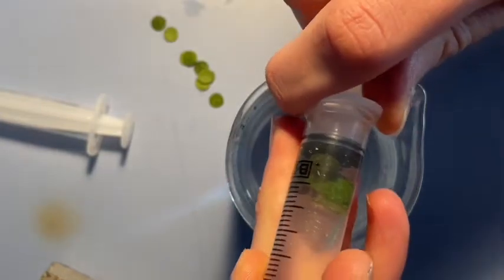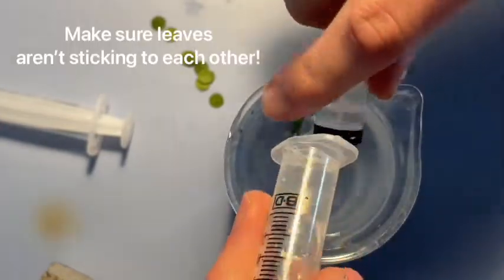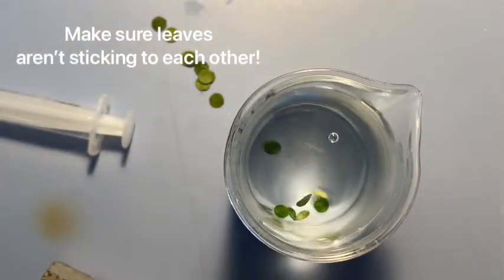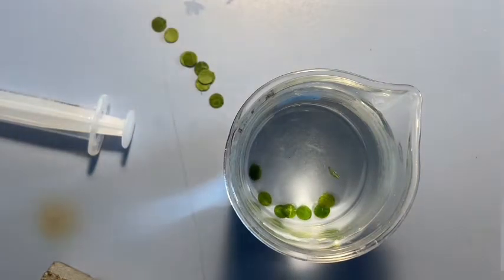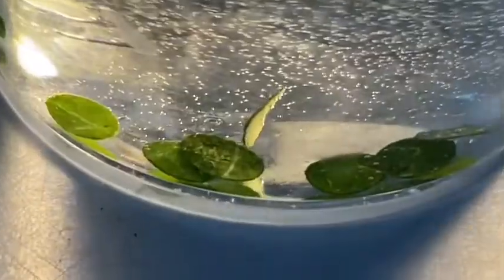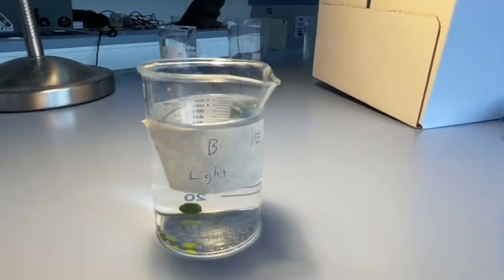Empty those into the beaker once again, and what should happen is the leaves should hopefully sink to the bottom there. So this is my light experiment.